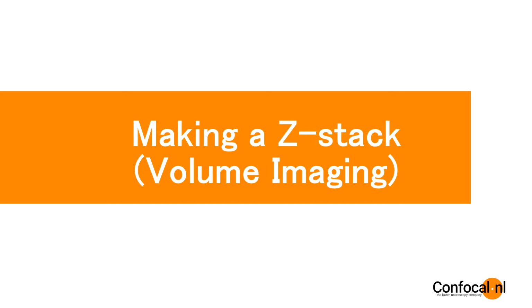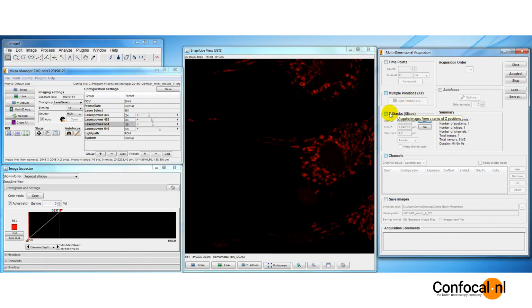Let's perform a Z-stack. Activate Z-stack in the multi-dimensional window. We can choose to set the volume in two ways. In the absolute Z mode, you define the top and bottom of the volume. We will go by the absolute Z mode.